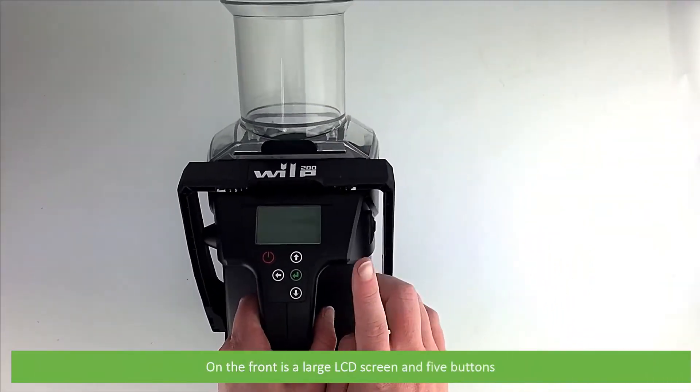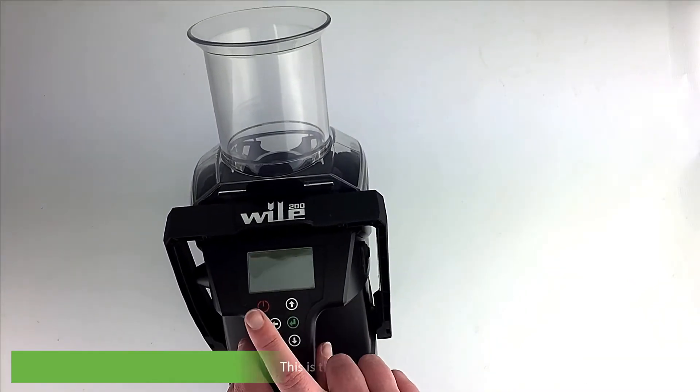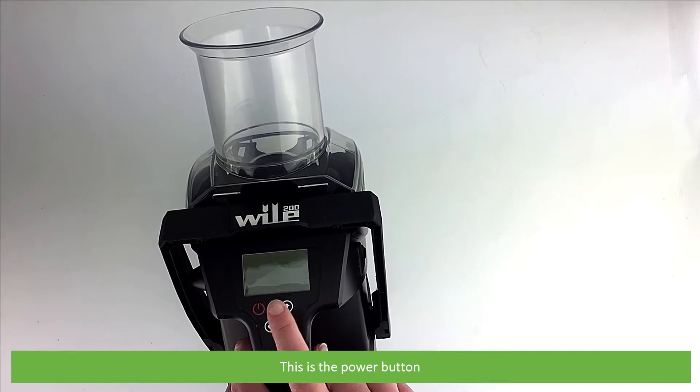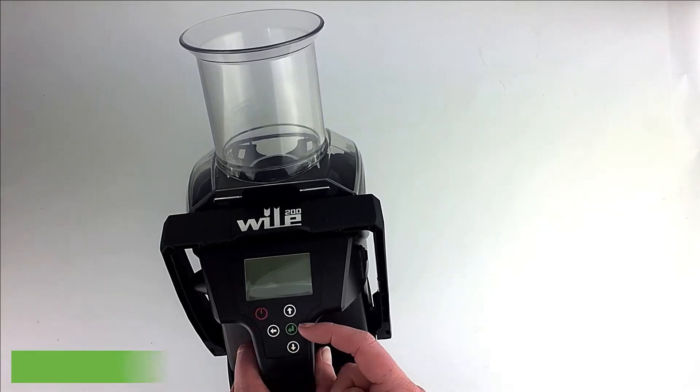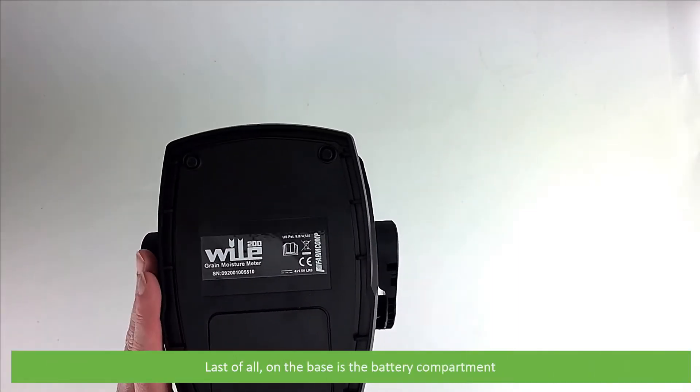On the front is a large LCD screen and five buttons: the power button, up, down, and back selection buttons, and the enter button. And last of all, on the base is the battery compartment.